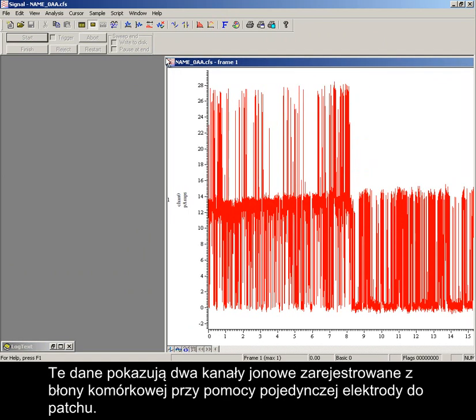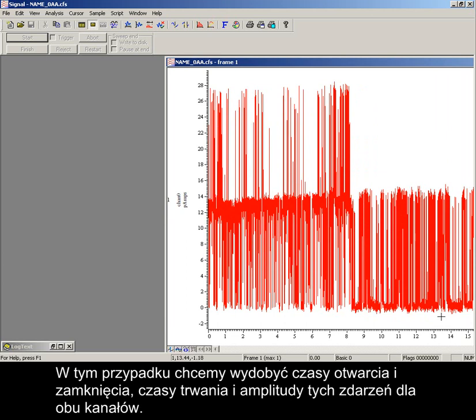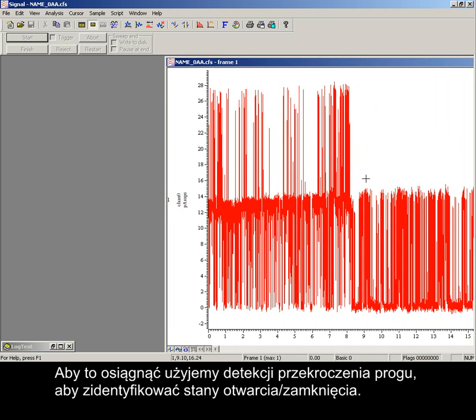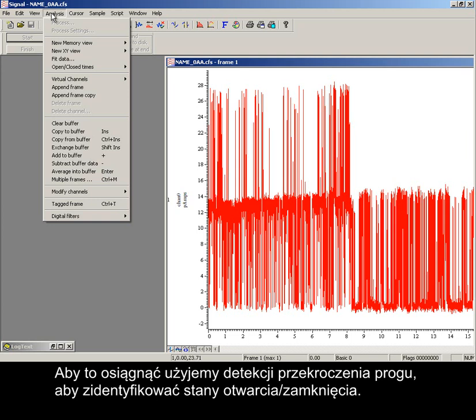The data here shows two ion channels recorded with a single patch electrode from a cell membrane. In this case, we want to extract the open and closed times, durations and amplitudes of these events in both channels. To achieve this, we will use threshold crossings to identify the open-closed states.